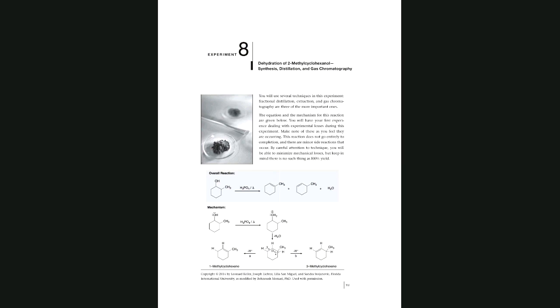Thermometer adapter, very good. Thermometer adapter, what else? I need the thermometer adapter. I have to grease the thermometer adapter and twist and push. Is anything else missing?